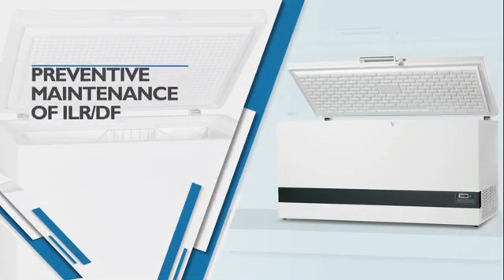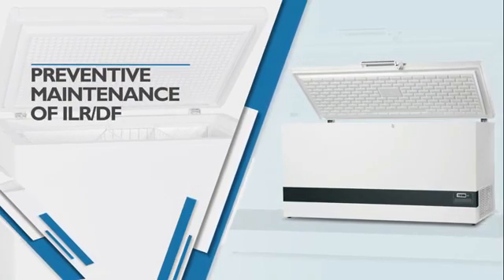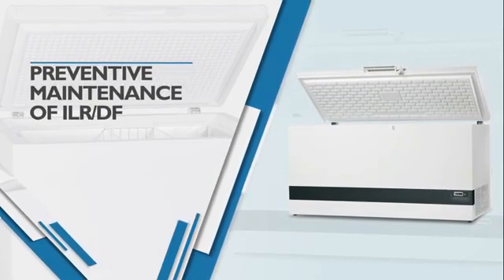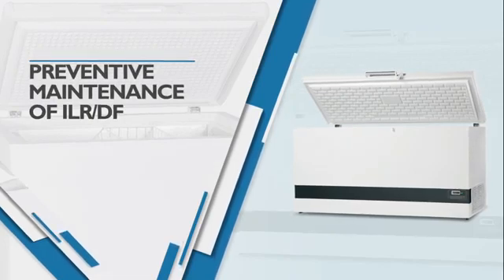Preventive maintenance of an ILR or DF is important for the proper working of the cold chain management system and ensures reduced system failures. Let's learn how to carry out the preventive maintenance of ILR or DF.